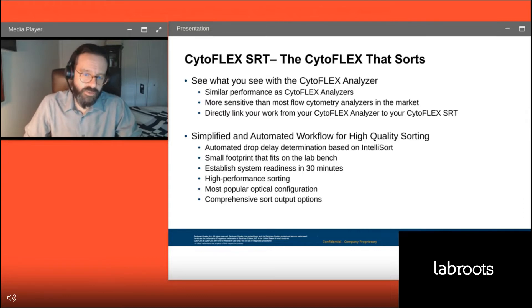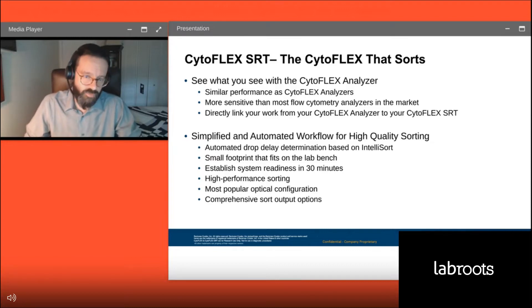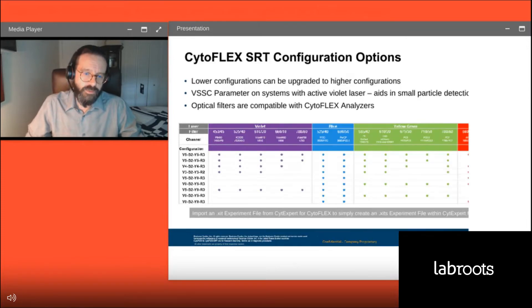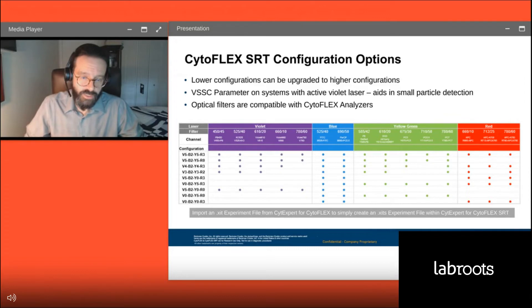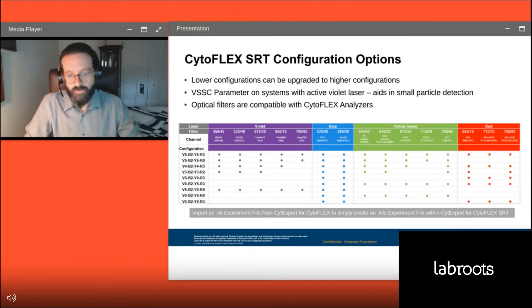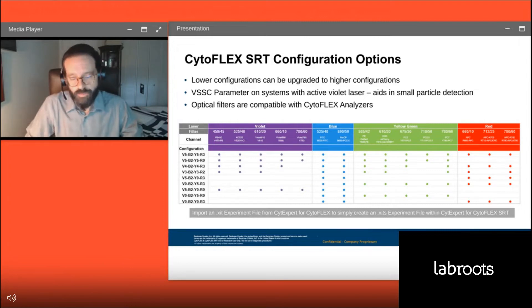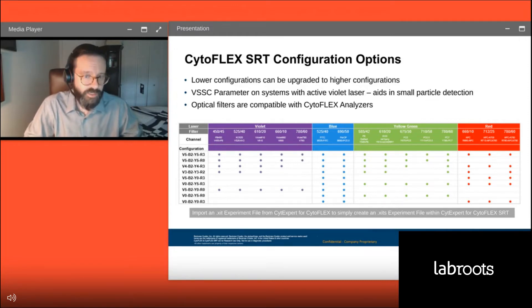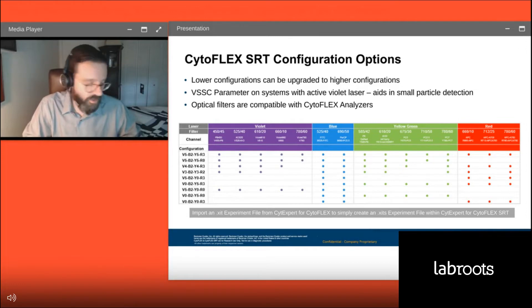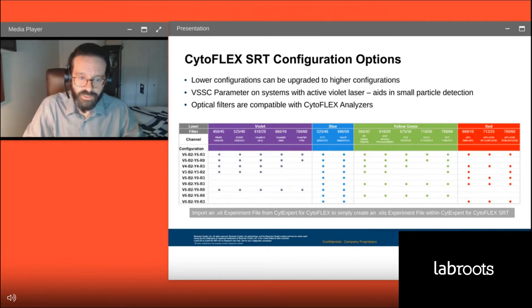With easy one-click interfaces to get quality control done and your sort set up, we have violet, blue, yellow-green, and red lasers available in multiple configurations to meet the needs of your lab now and in the future. Importantly, these are field-upgradable and optical filters from your CytoFLEX analyzer are exchangeable with what's in the CytoFLEX SRT.